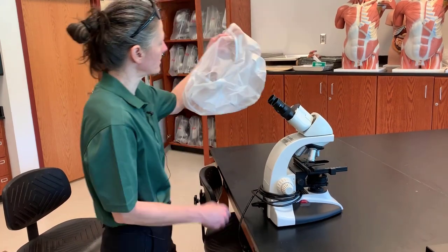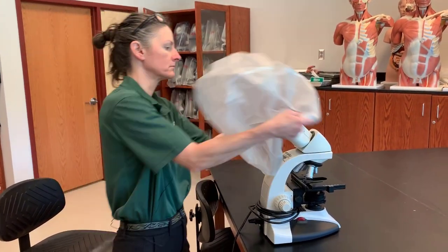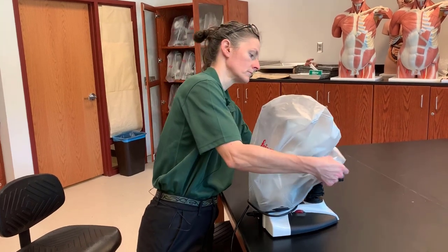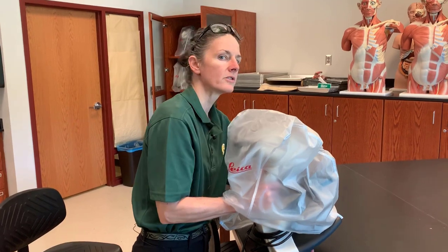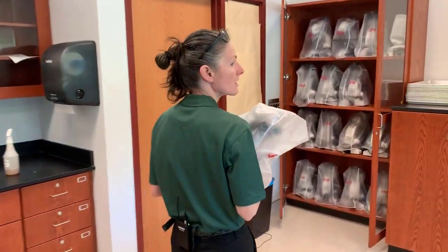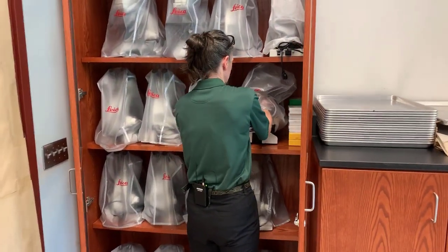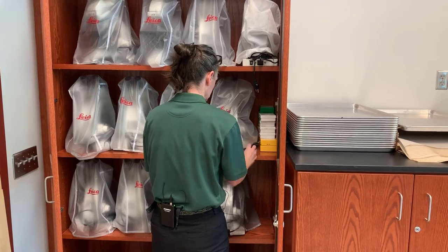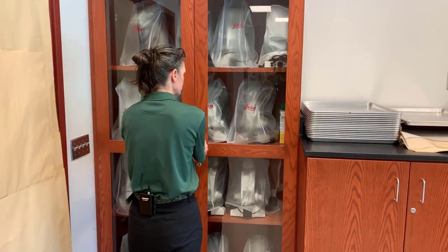You will replace the dust cover and grab the arm again under the dust cover and under the base — now you have a very stable way to carry the microscope and you are not likely to drop it. And that covers our use of the microscope.